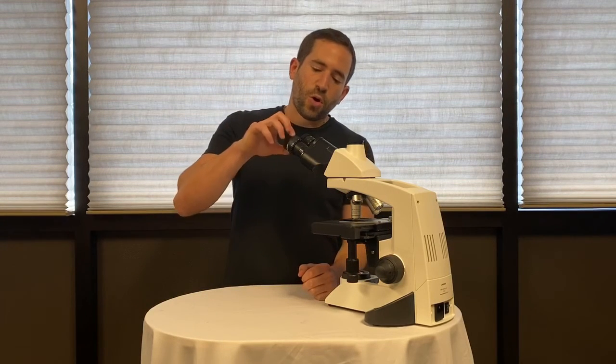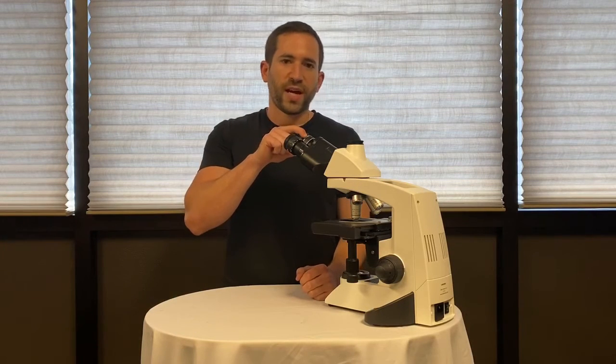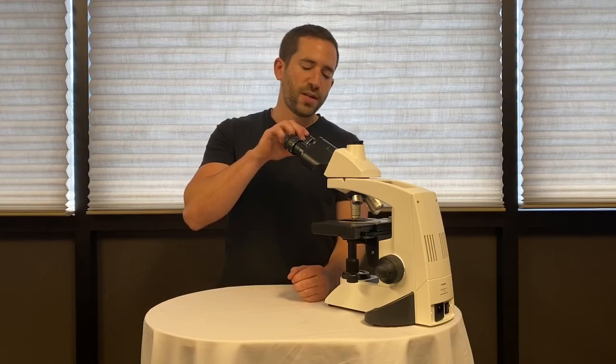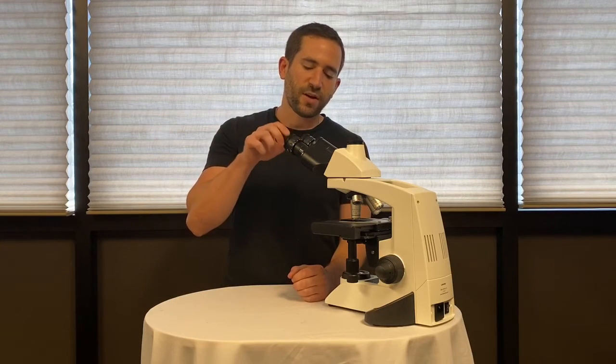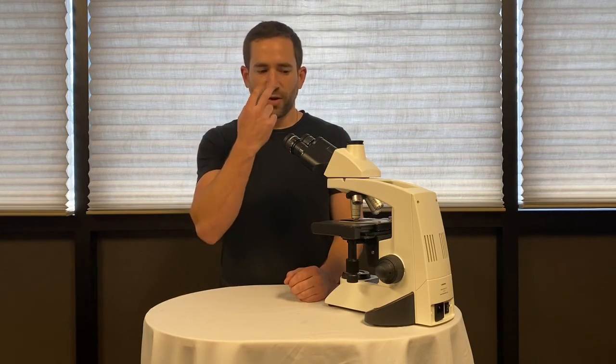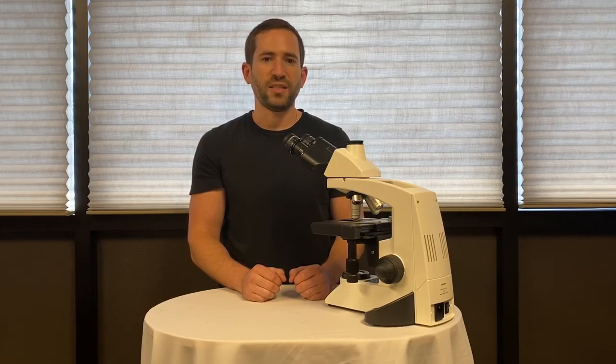If your eyepieces are both focusing and one is all the way up and one is all the way down, it can appear that the microscope is out of alignment. So make sure that you set your eyepieces to the zero mark. This will allow you to adjust them again for the differences in your eyes and allow your whole entire system to be parfocal and easy to use.